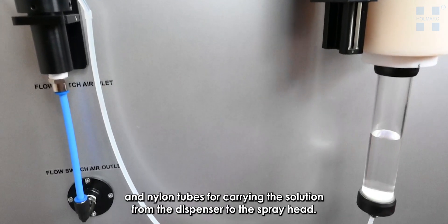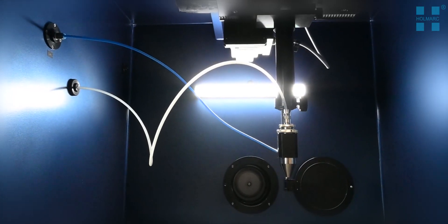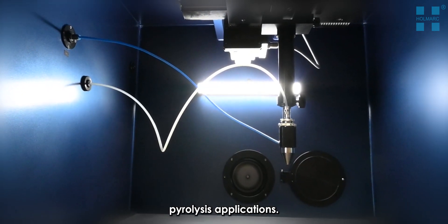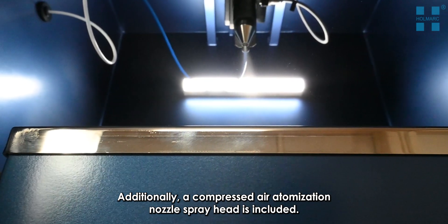Nylon tubes carry the solution from the dispenser to the spray head; nylon is chosen for its chemical resistance in spray pyrolysis applications. Additionally, a compressed atomization nozzle spray head is included as standard.